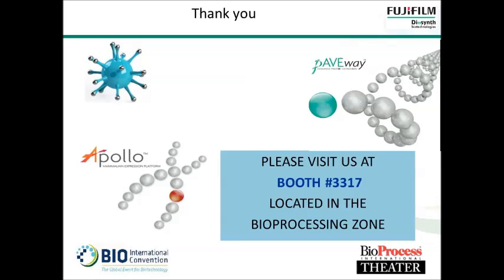Okay. So as I mentioned early on, it takes about 3 months to identify the top condition in the PD lab. Then it takes 1 to 2 sets of DOE studies in the bench reactors, which take about 1 to 2 months. Then scale up to the 200 liter tox batch takes another month. So I would say it takes less than 6 months, probably around 5 months, before we can move to manufacturing. And the manufacturing takes about 1 to 2 months to complete. So essentially it takes about a little bit of half a year to generate material for the clinical needs of the client.